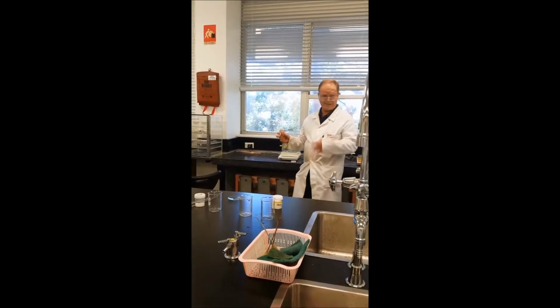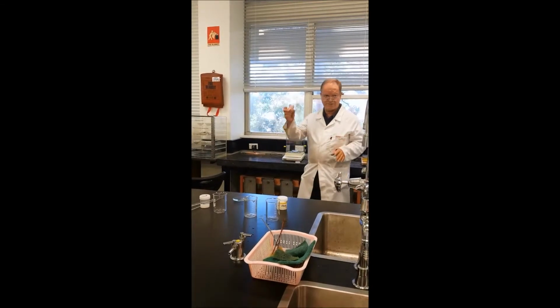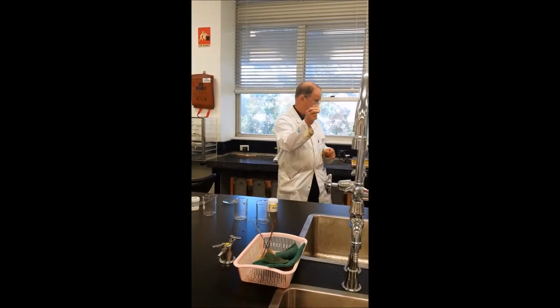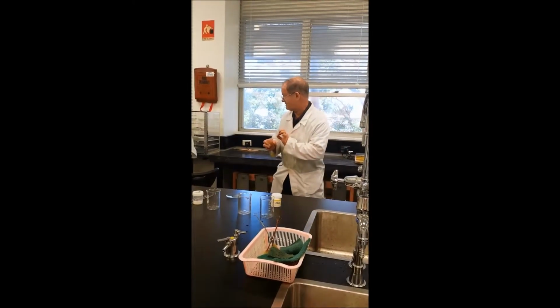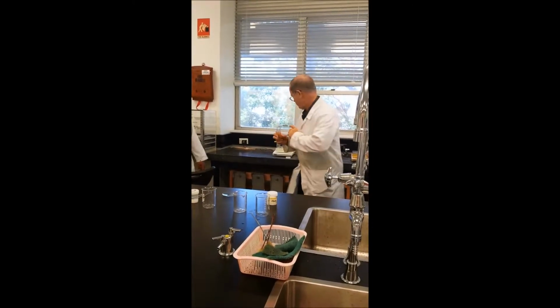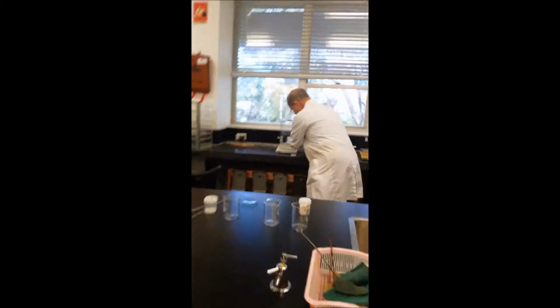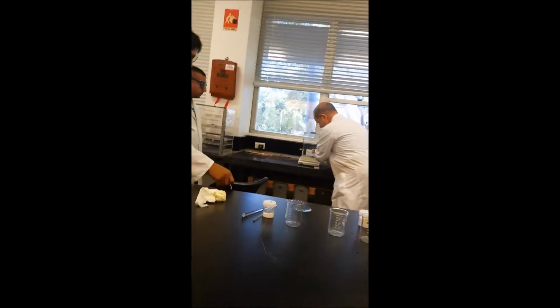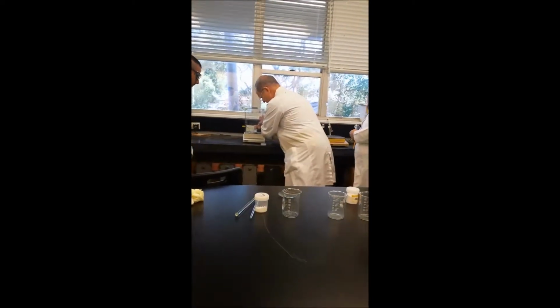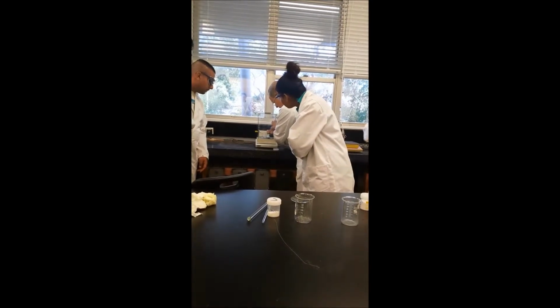Now, when you've got a lot of people fiddling about around here and we're rushing around all over the place, best not to use a spatula. Now, most of you are familiar with the idea of shaking something out of a container. You can do that this way, and you get the lid right over the middle. We're going to 0.048, so I shake some out. We're up to 0.004, 0.014.